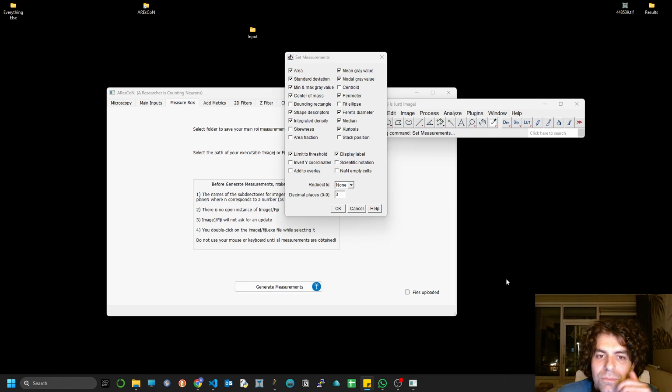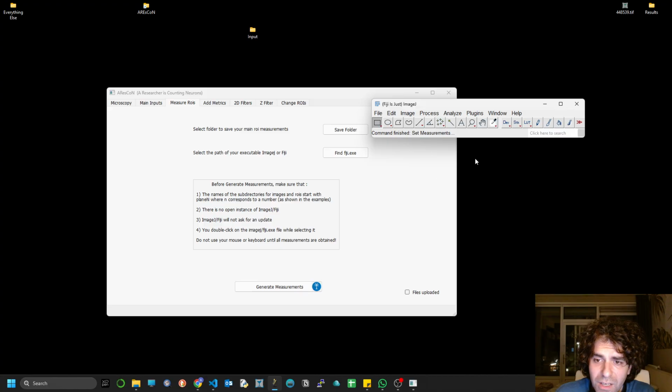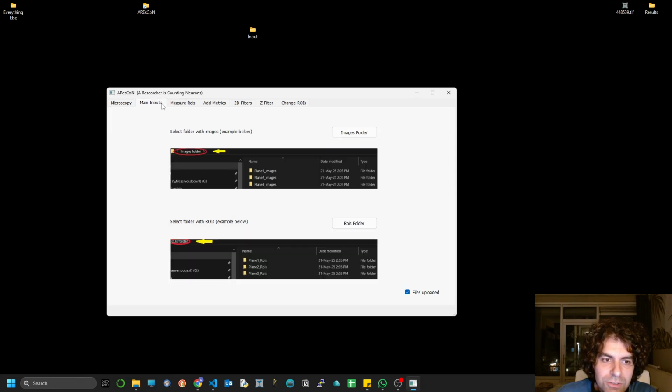Okay, so these are the measurements that I want you to select. Actually, not all of them are really of use, but please select them so that we're on the same page. And after you do that, close Fiji. Alright, you don't want to have Fiji open, and let's do the rest.